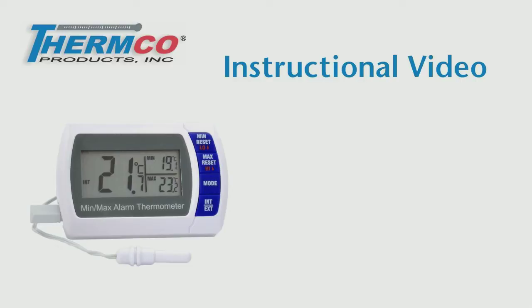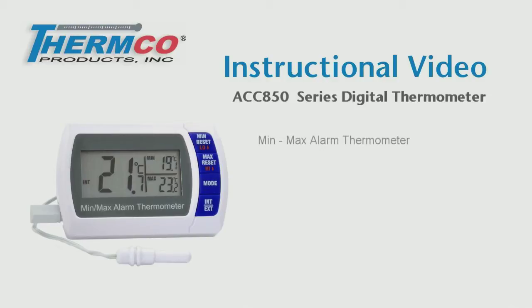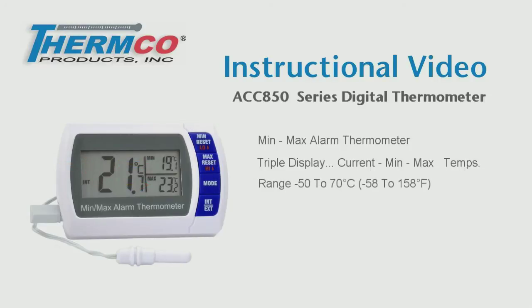Welcome to Thermco Products. This instructional video is for the model ACC850 series of digital thermometers. This unit is a min-max alarm thermometer with a triple display that simultaneously shows the current, min, and max temperatures. It has a temperature range of minus 50 to 70 degrees Celsius, minus 58 to 158 degrees Fahrenheit, with an accuracy of plus or minus half a degree C and F.